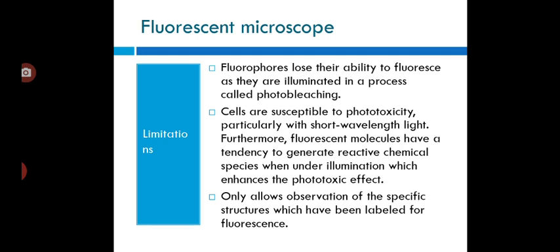Cells are susceptible to phototoxicity, particularly with short wavelength light. Furthermore, fluorescent molecules have a tendency to generate reactive chemical species when under illumination, which enhances the phototoxic effect.